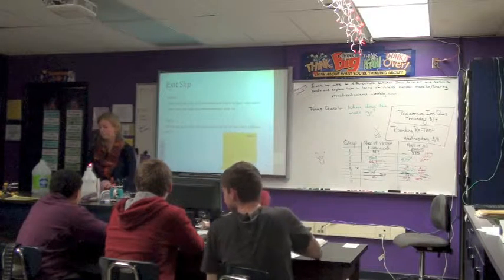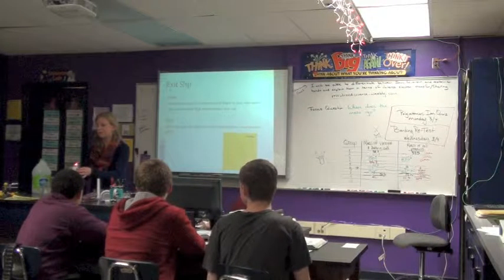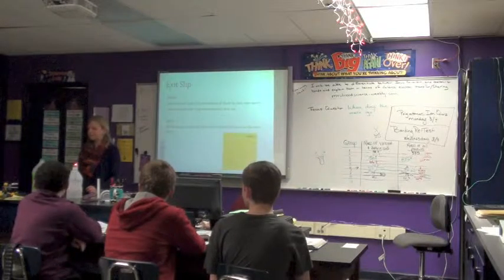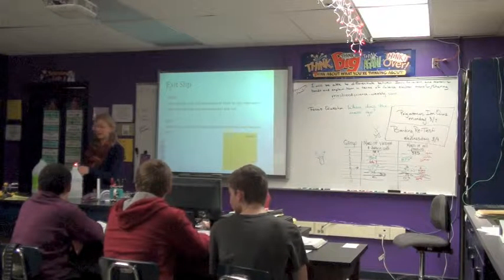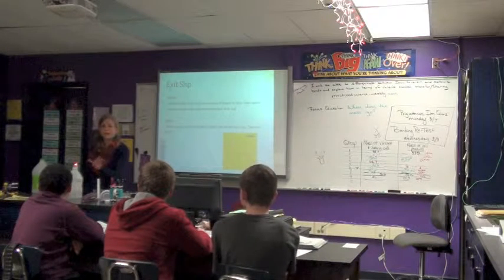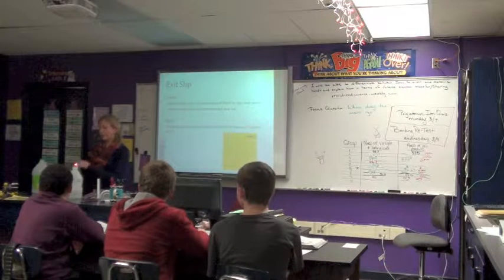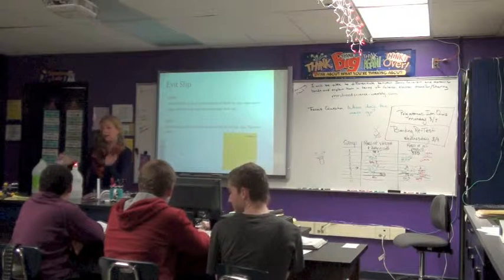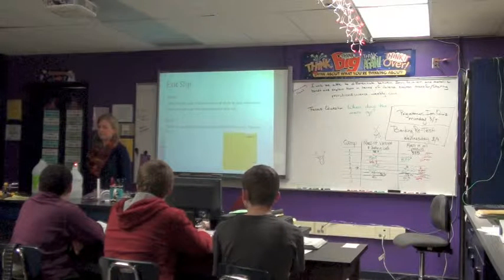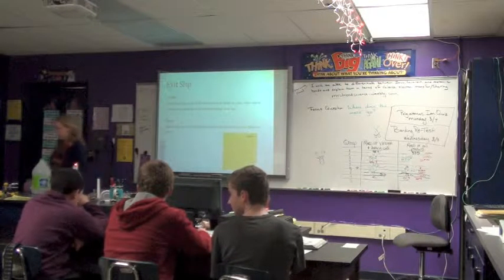So, I'm going to prove to you that the gas that we did form was carbon dioxide, okay? So I'm going to do the same reaction but in here, not in the zip-off bag. And what's going to happen is the carbon dioxide gas is going to form up here. Well, this flame is using what gas to keep burning? Oxygen. So if the carbon dioxide is sitting on top and I pour it out onto there, then it will push away all the oxygen, and what should happen to the flame? It should go out, right? Okay, so let's see if it really is carbon dioxide.